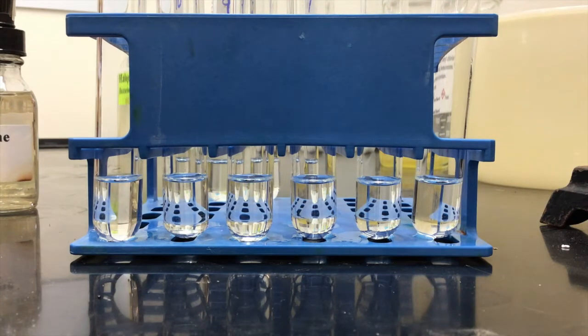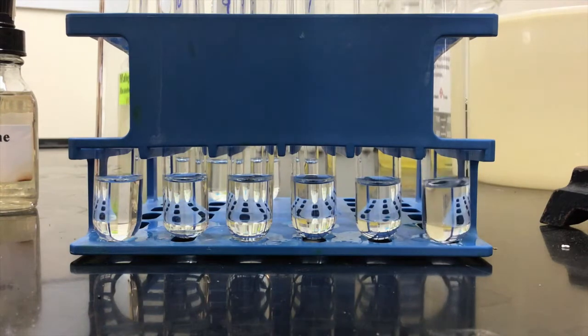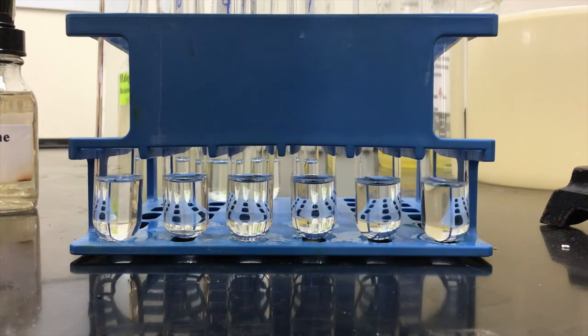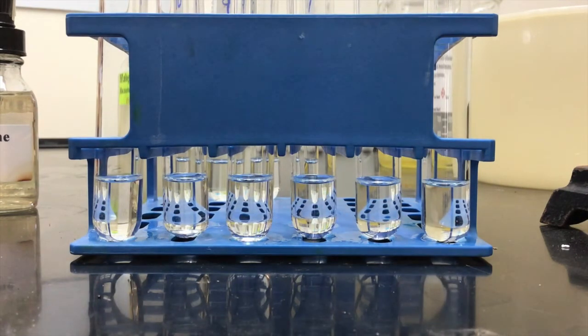And so now what we're going to do is the Sn1 reaction conditions. So we're using all of the same substrates, compound 1 through 10 in the same order again. But this time what I have here is a solution of silver nitrate. And again, this is a 1% silver nitrate in ethanol solution. So this is the polar protic solvent.